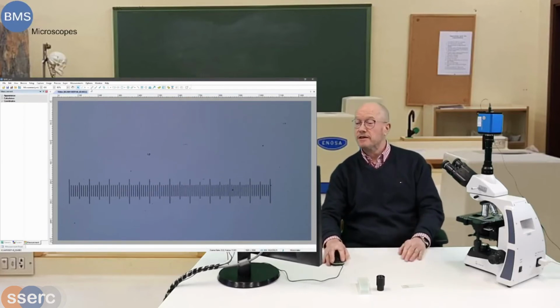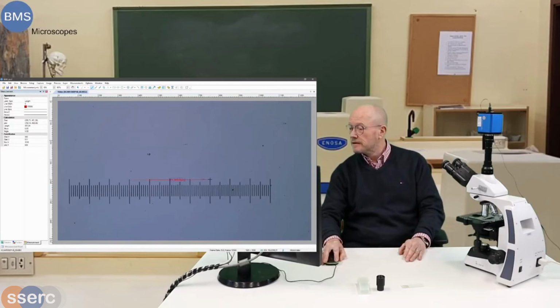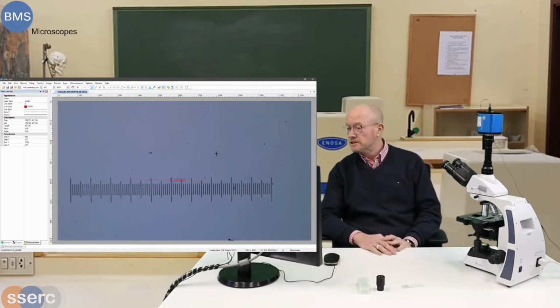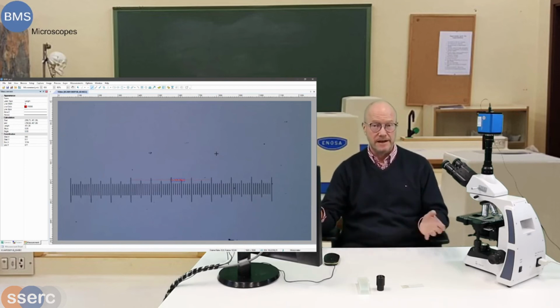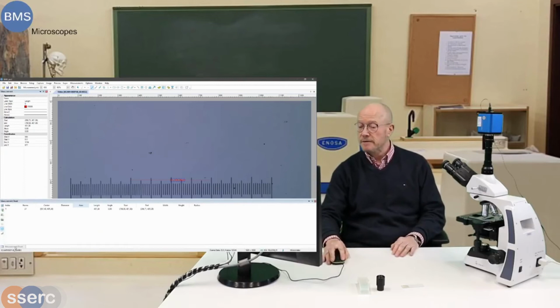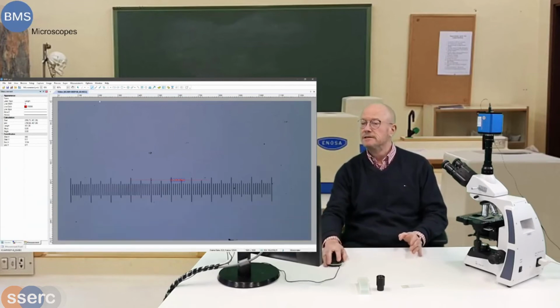Let's have a quick look to see if we're right here. If I start from here, go all the way up to here, and lose it. It's 1, 2, 3, 4 big units, which is approximately 400 microns. We know that micrometers, we know that already. And if we look at the measuring sheet, it gives us 401.38. Not too bad, is it?